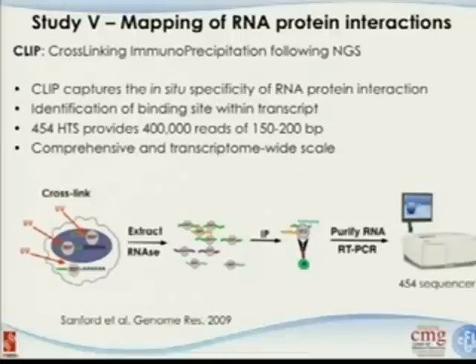The experiment itself differs in that instead of using formaldehyde for the cross-linking, we use UV light to induce those protein-RNA interactions. There's a small difference from using formaldehyde. When using formaldehyde, you will induce protein-protein interactions as well, but UV light won't induce protein-protein interactions. It's only protein-RNA or protein-DNA interactions. After the cross-linking, you do the regular steps, and then you use an antibody to target the RNA binding protein we're interested in. In this case, it's a protein called SF2, and then you do the sequencing.